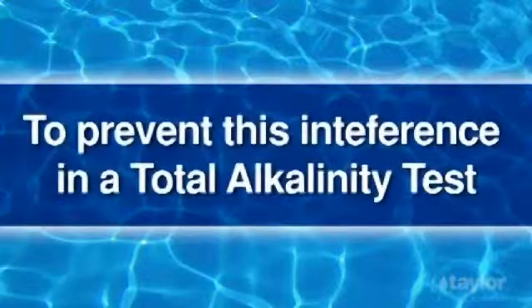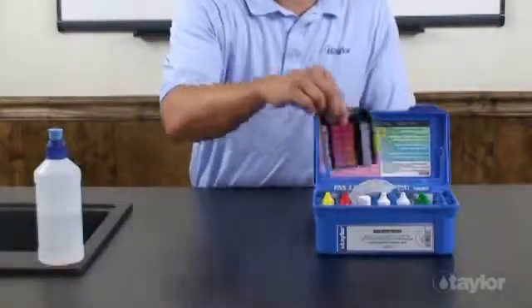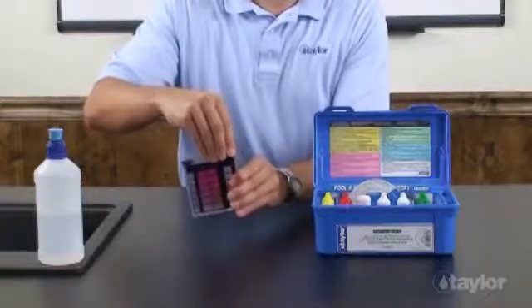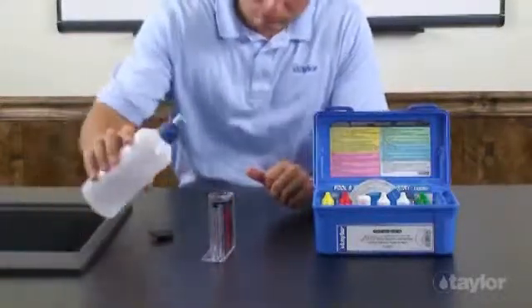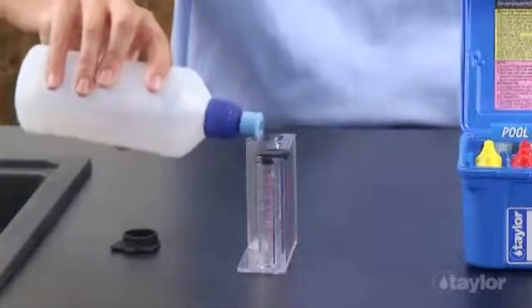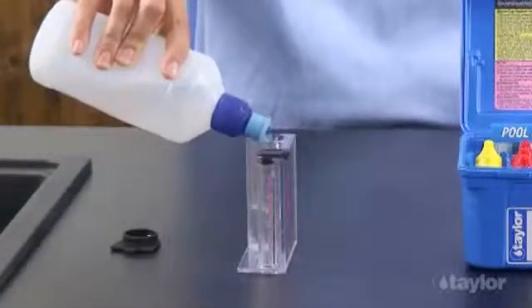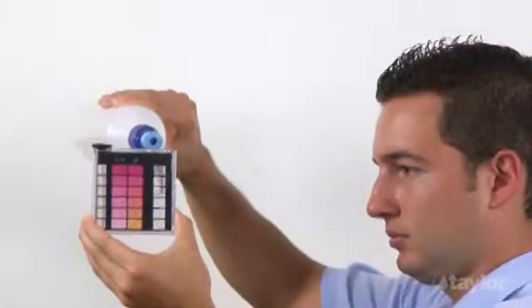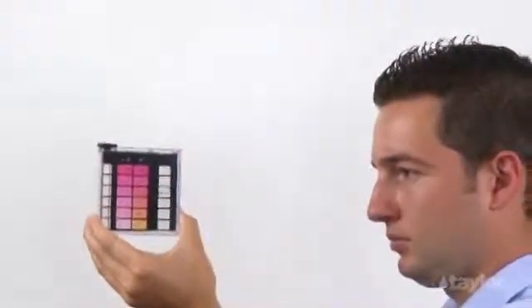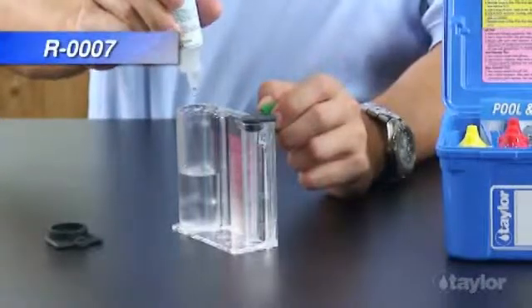To prevent this interference in a total alkalinity test, retest by adding one additional drop of reagent 7 in step 2, for a total of three drops of thiosulfate. Rinse and fill the large comparator tube to the 25 ml mark with the water to be tested. Add three drops of reagent 7 to neutralize the sanitizer residual.